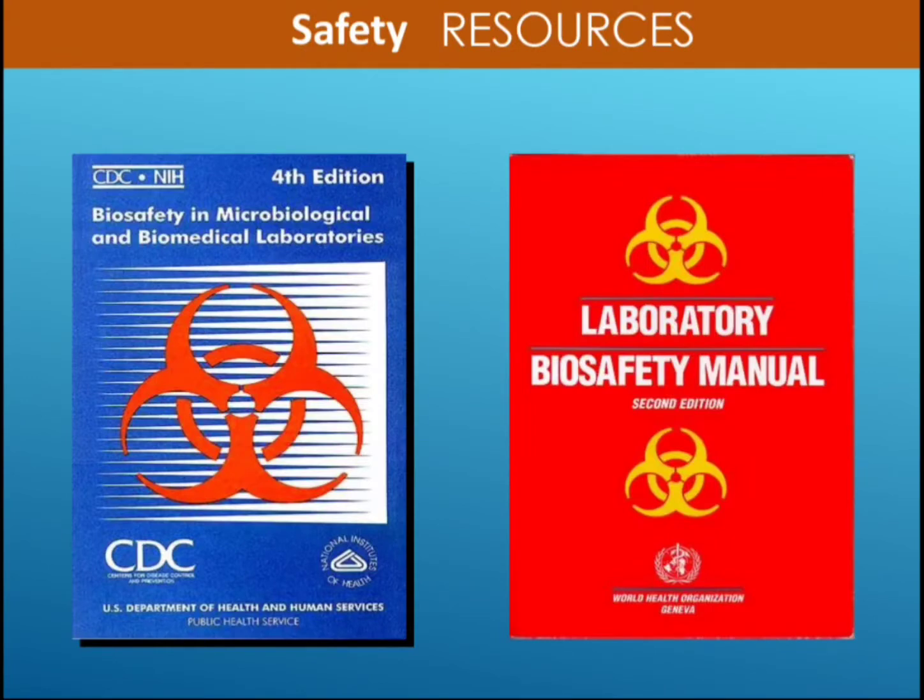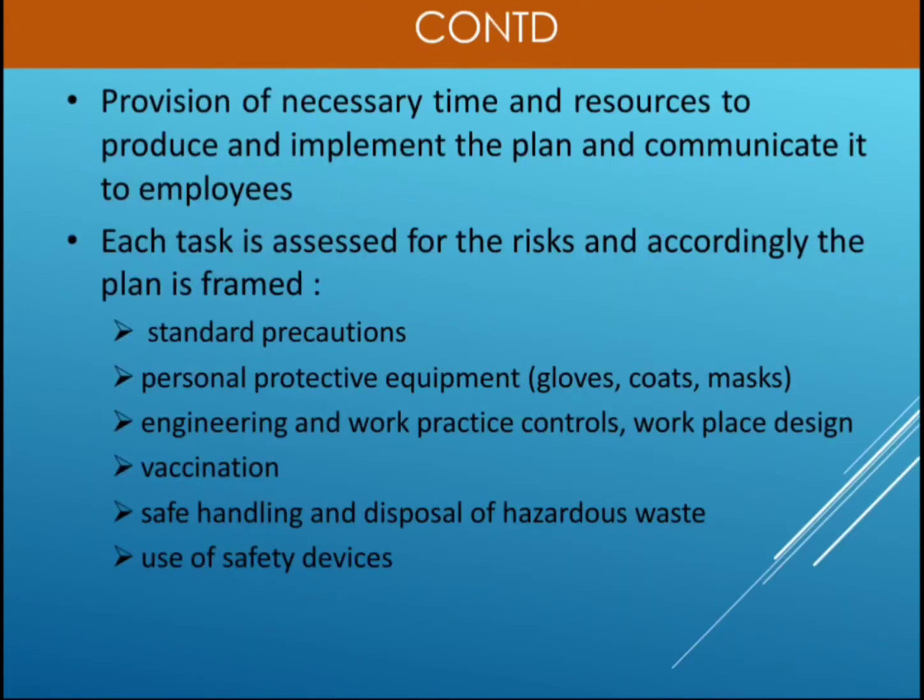Now these are the safety resources which we refer to in the laboratories in which you are working: Biosafety in Microbiological and Biomedical Laboratories, and the Laboratory Biosafety Manual, second edition, which is to be referred to for practicing all these laboratory safety measures. Now, provision of necessary time and resources to produce and implement the plan and communicate it to the employees is the prime concern. Each task is assessed for the risks and accordingly the plan is framed.